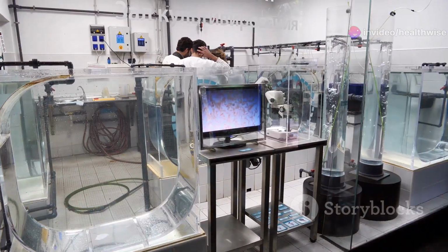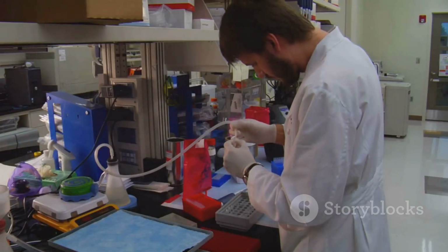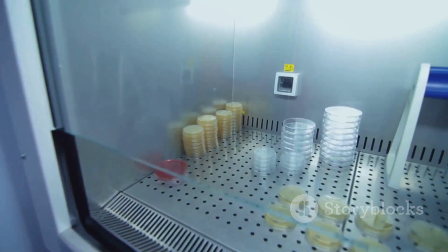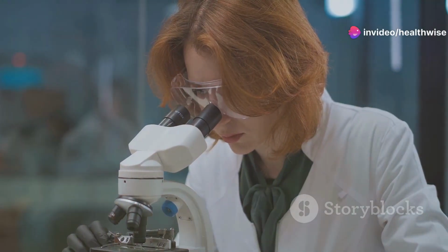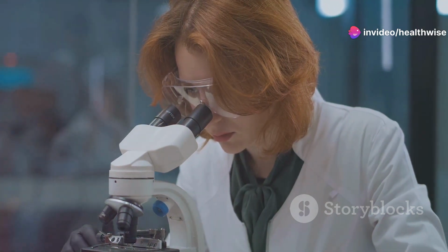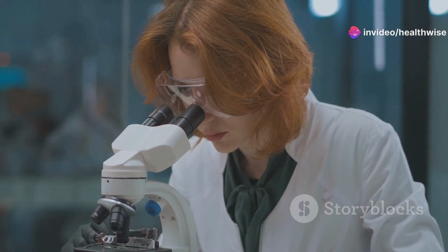Section 4. Uses. Incubators have a wide range of uses in laboratories. One of their primary applications is in microbiology. Bacterial cultures are often grown in incubators to study their behavior, test antibiotics, and conduct various experiments.